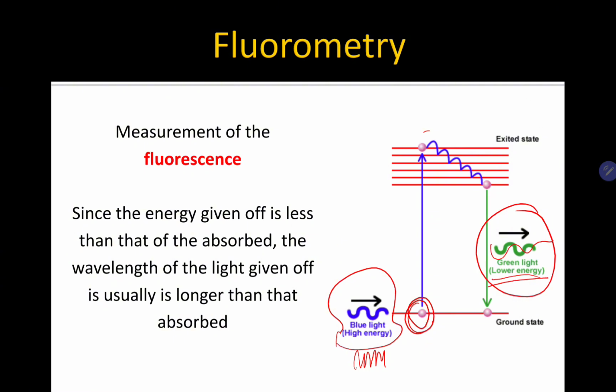So basically, based on this diagram alone, guys, you can clearly measure kung ano yung analyte mo. Magets so far? Let's say for example, nagbigay ka ng 500 na light source. Your electron atom will become excited, and then will now release, let's say for example, 80, low energy. Since nakita mo na 80 lang yung kanyang ginarelease, therefore you can conclude na ang light absorbed niya is 500. Based sa kanyang light na emit, you can now compute the amount of energy or light absorbed by that electron.